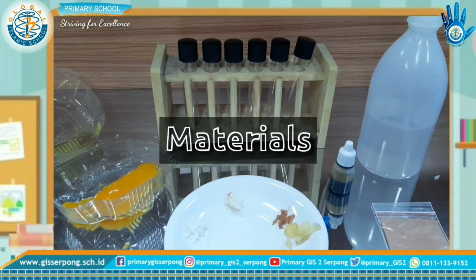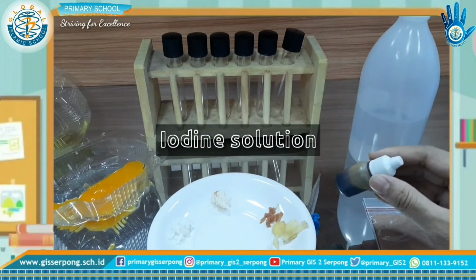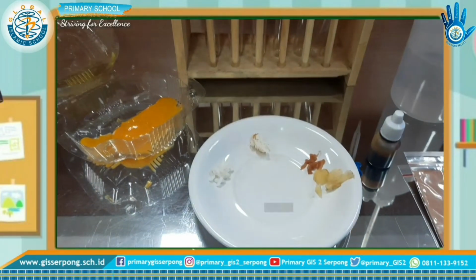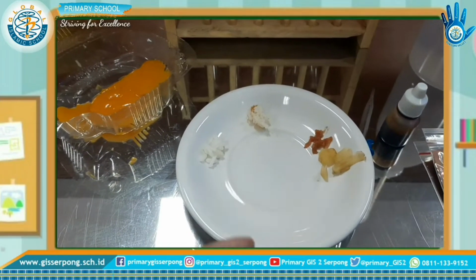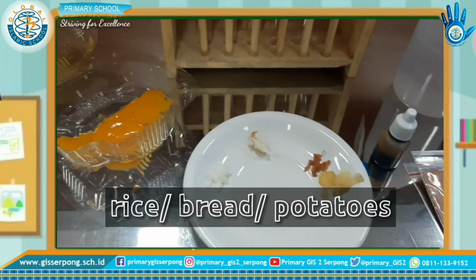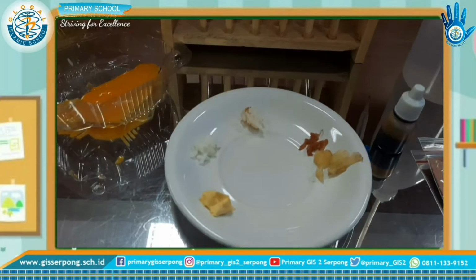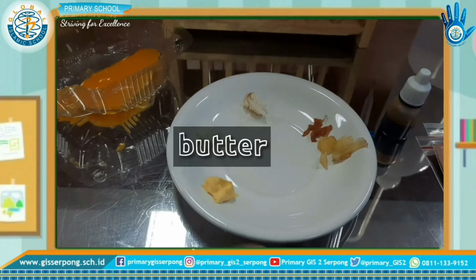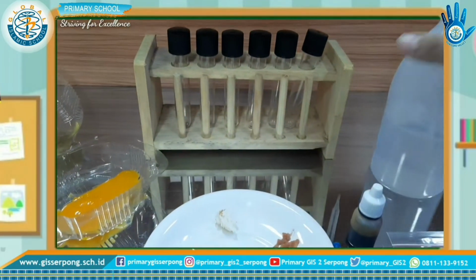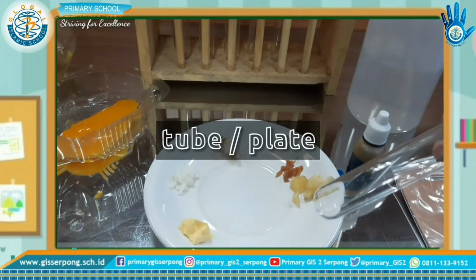The materials we need are iodine solution, and then brown paper, and the sample of food like rice, bread, or potatoes, and then yellow egg and butter. Don't forget to prepare water, and then tube or plate.